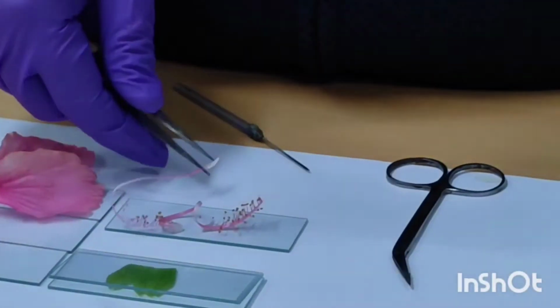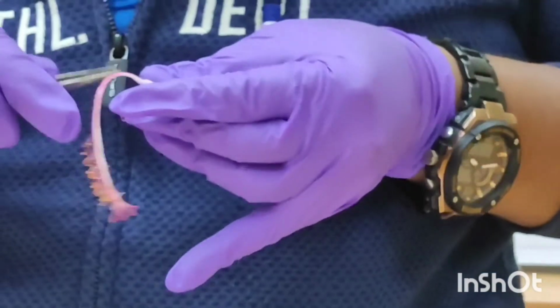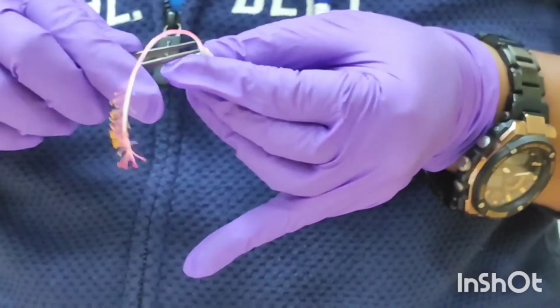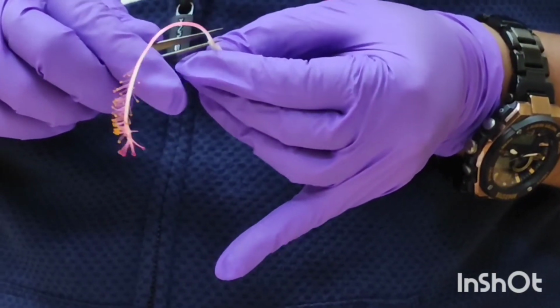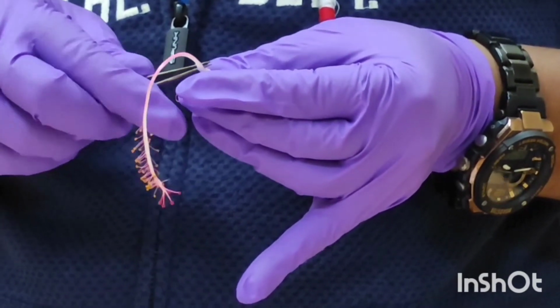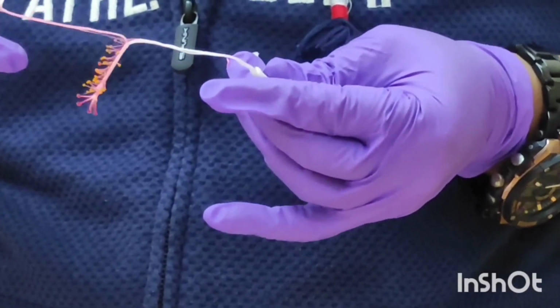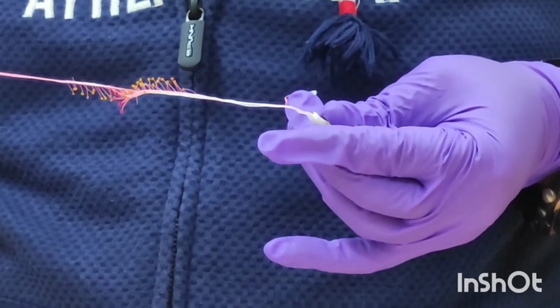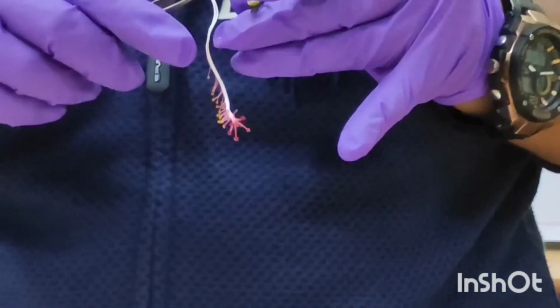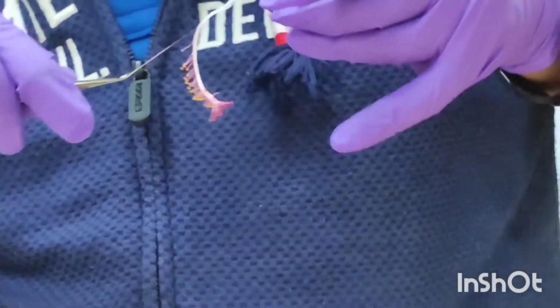The androecium, the stamens are united in this case, so the stamens are monadelphous in nature. You can see 5 bright red colored stigma at the top of the gynoecium tube.